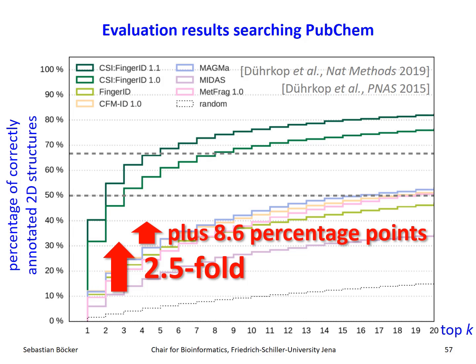And this is so dramatic, and we have now been fighting after we've gotten to this point that we got 2.5-fold more annotations. We thought, okay, this will continue like this, and we will soon pass the 50%, but this never happened. It's really, as often with machine learning, you have one great idea, multiple kernel learning in this case, and it really transforms everything, but then you fight really hard for every single percentage point, okay? And I have no idea how far we can get here.